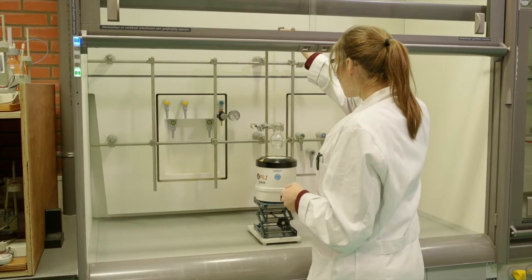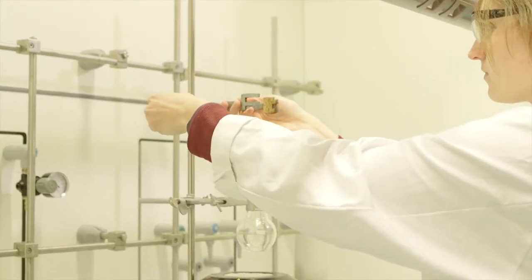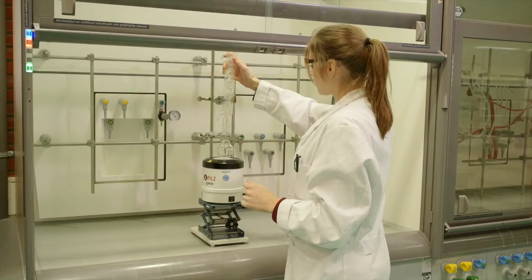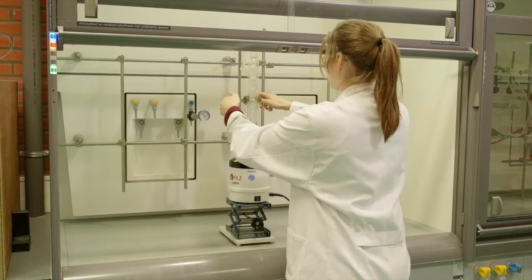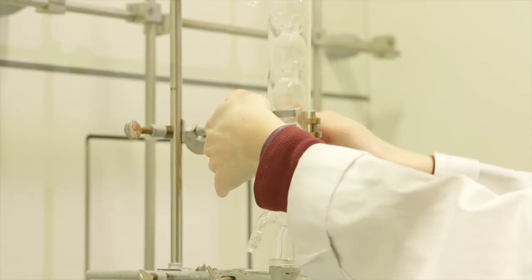Attach a second clamp to the stand. Place the condenser on the flask and attach the clamp to the condenser. The clamp should be attached to the middle of the condenser, not at the top. The setup is now almost complete.